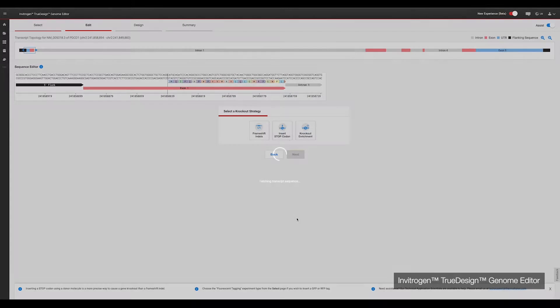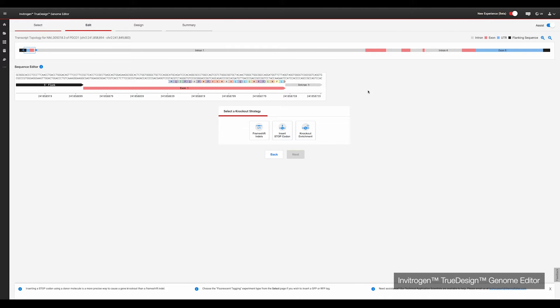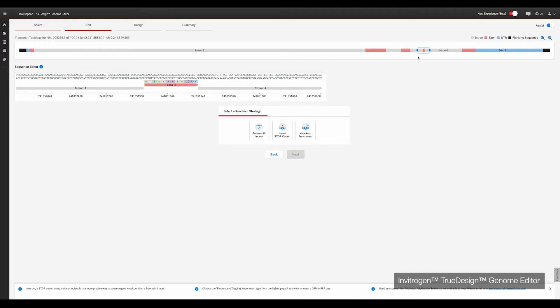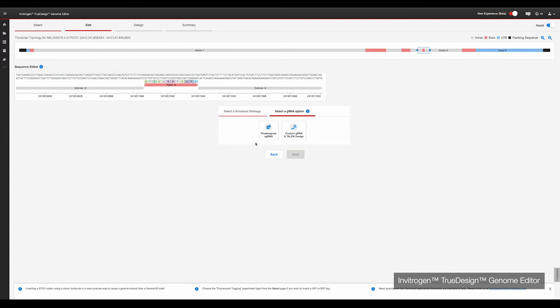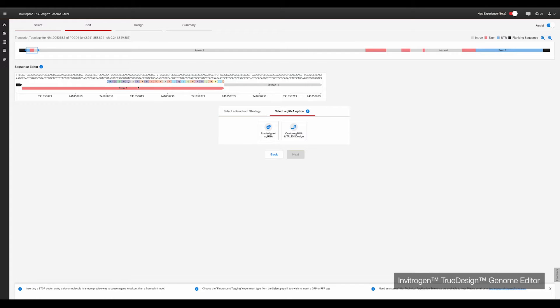Next, you will pick the transcript of the gene you wish to target. You then need to select the type of knockout edit you wish to perform. Today, we will use frameshift indels. TrueDesign gives you the option to use pre-designed gRNAs that will target the first exon of a gene, or custom gRNAs. Today, we'll choose pre-designed synthetic gRNAs.